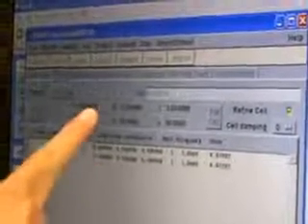If you are thinking this one is good, that means the lattice parameter corresponding to the current level is the closest reflection for the real case. So that means you can believe the current lattice parameter. Instead of the starting one. For example, you have two raw spectra — one is zero stress, one is 500 MPa. You refine on both respectively, and you get a good refinement. So you will know the lattice parameter corresponding to zero stress and the new lattice parameter corresponding to higher stress. This can only tell you: I'm getting a good refinement, so I believe the lattice parameter here.